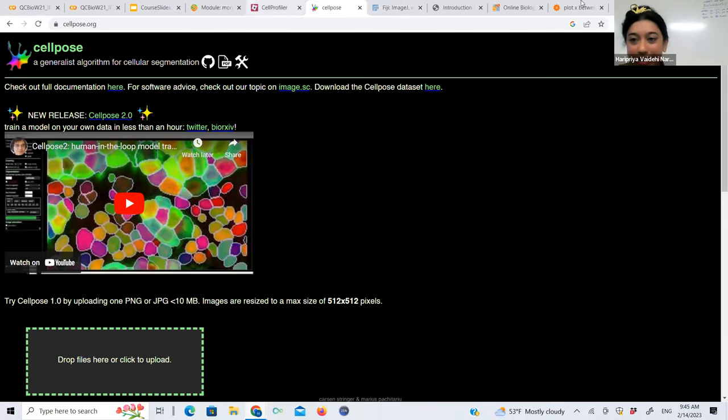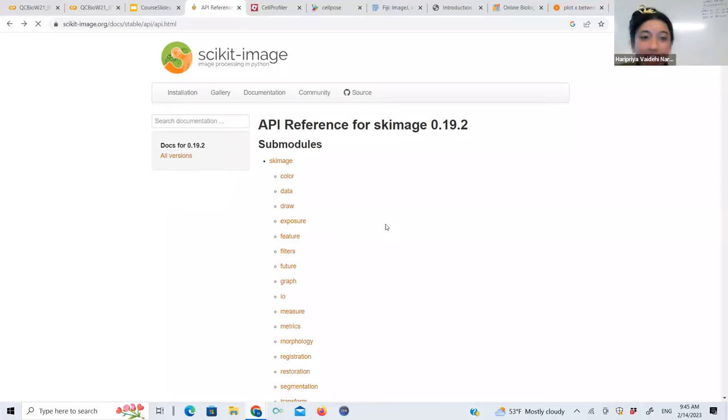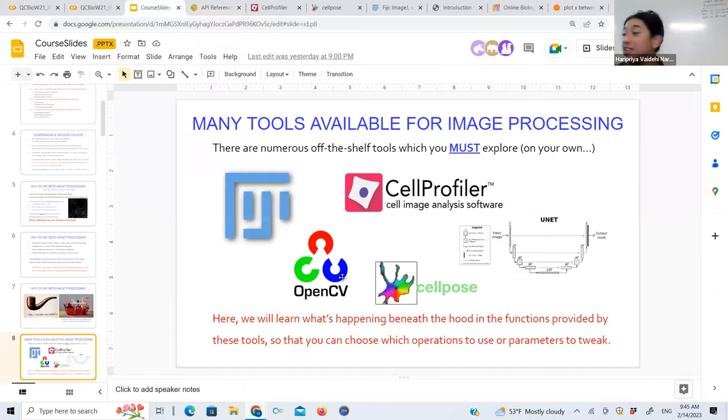And what else? Yeah, so I want you also to pull up scikit-image. That's the set in Python that we'll be working through during this workshop. And MATLAB has an image processing toolbox that does essentially the same things. And a couple of other things, yeah, there's OpenCV, which is for computer vision. It's like another Python toolbox.